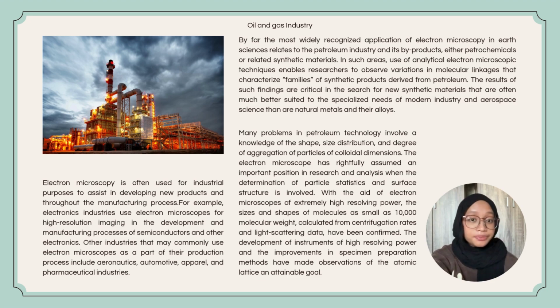In such areas, the use of analytical electron microscope techniques enables researchers to observe variations of molecular linkage that characterize families of synthetic products derived from petroleum. The results of such findings are critical in the search for new synthetic materials that are often much better suited to the specialized needs of modern industries and aerospace science than natural metals and their alloys.